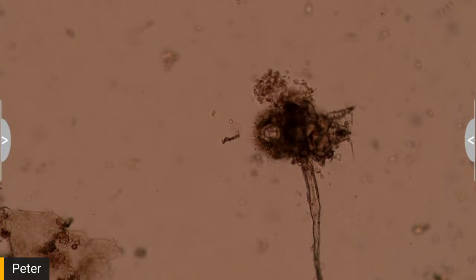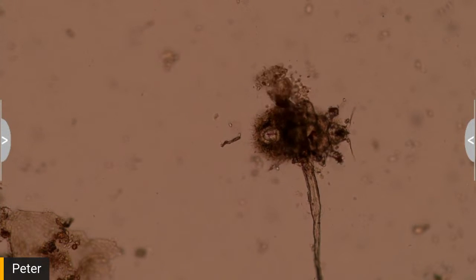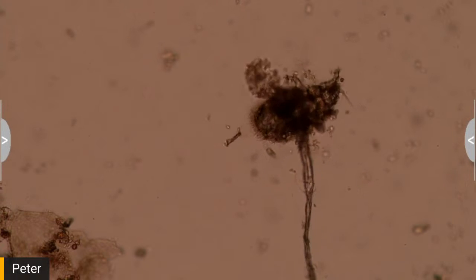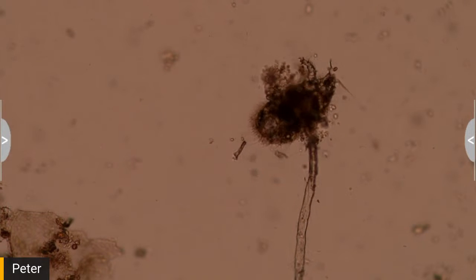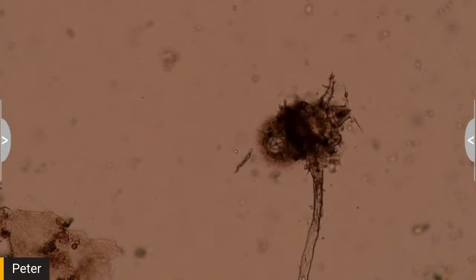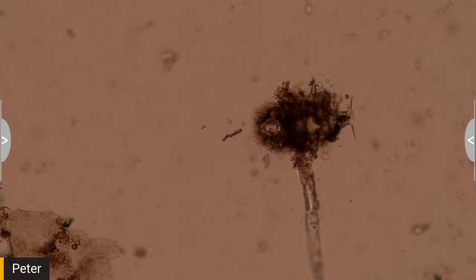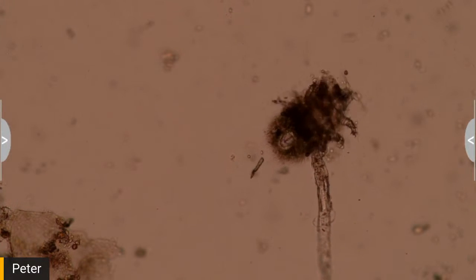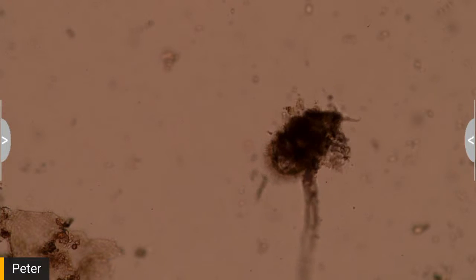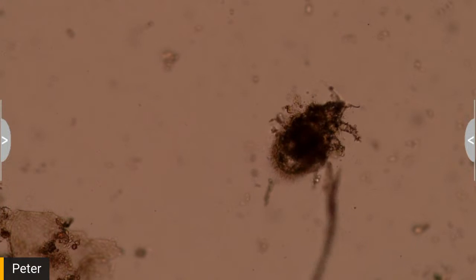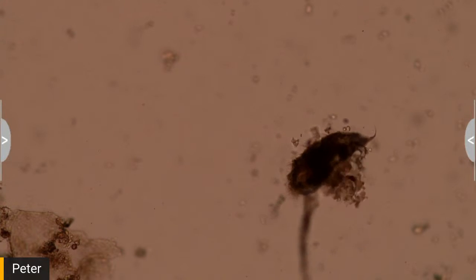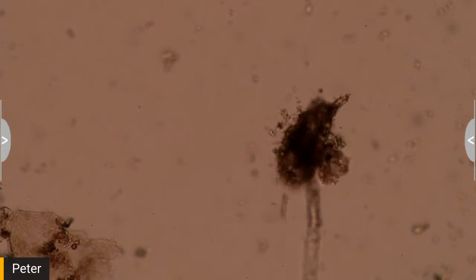Yeah, my vote is tardigrade. It looks like he's like stuck to the, it's like wrapped up or something and can't get out.